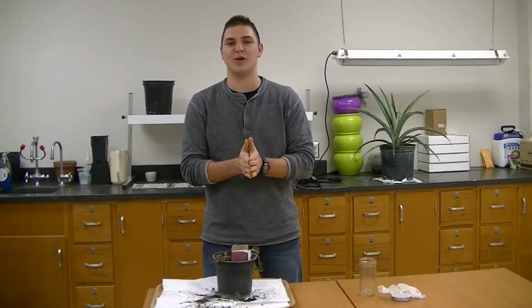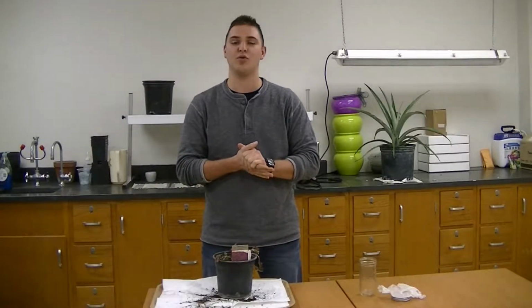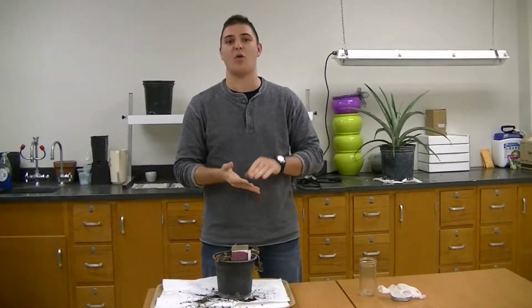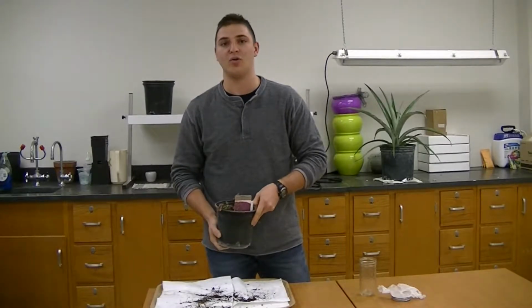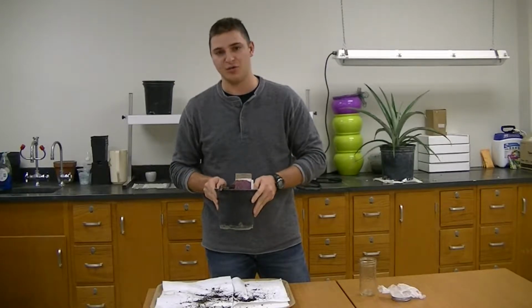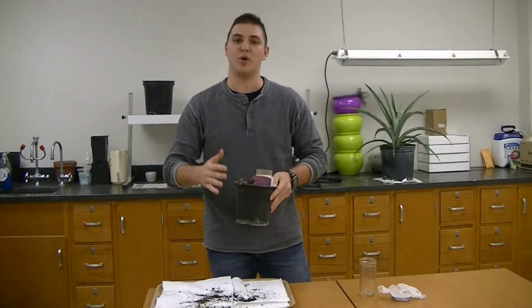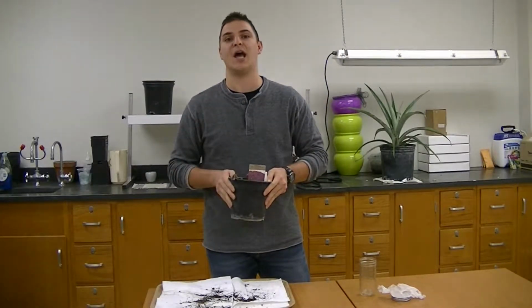My name is Adam Striegel, and today I'll be helping us go through some of the common fungal root rot diseases that we sometimes have in both our agronomic and our horticultural crops. Here we have a plant that we got from a local greenhouse, and we're going to be looking to see if we can find some disease lesions on the roots, and then we'll be talking about using selective media in order to help determine which specific fungal disease is at fault.